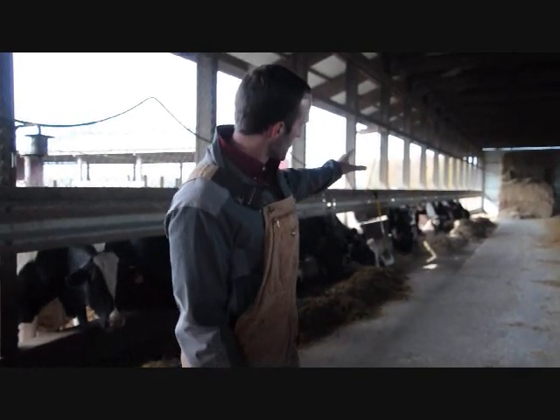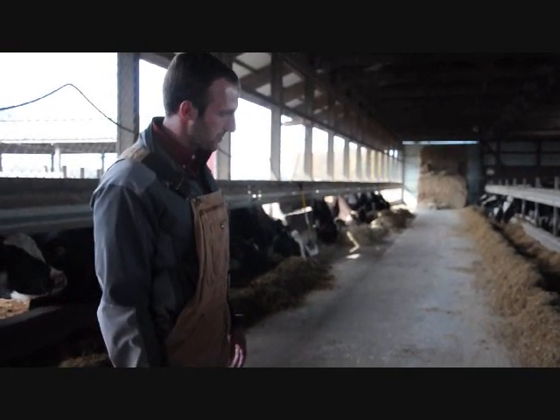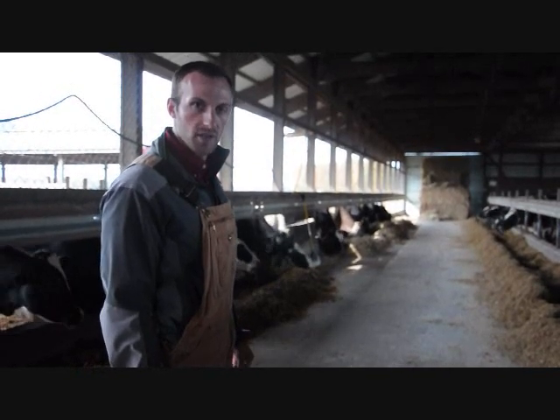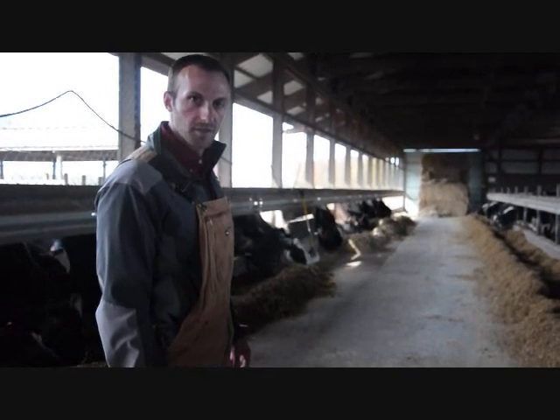I'm going to start this morning by taking the TMR sample. We'll show you how to accurately take a TMR sample, or the best that we can. And then we're going to go through taking manure samples as well and show you how to mix and subsample those so we can get the best sample we can off to the lab.